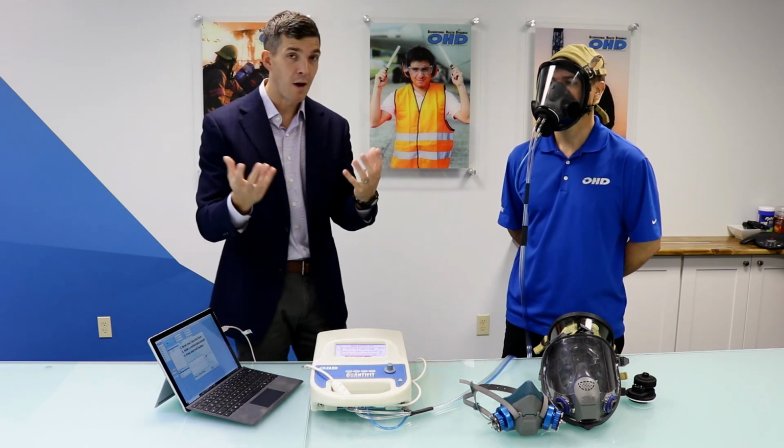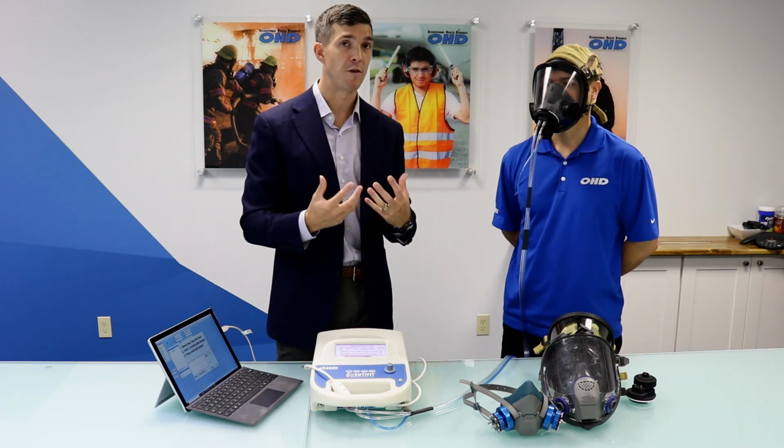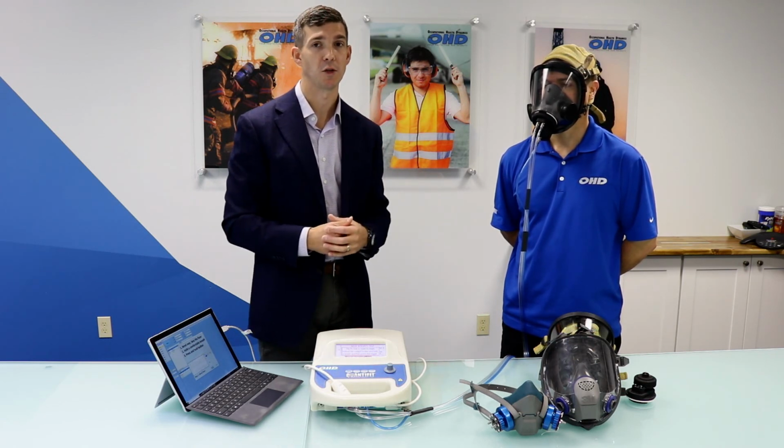But then the last thing, and obviously most important, is actual fit. Do we have the right size? Does Steven know how to properly don and wear this respirator? All of the training components. And that's where fit testing really gets into an important part of your respiratory protection program.